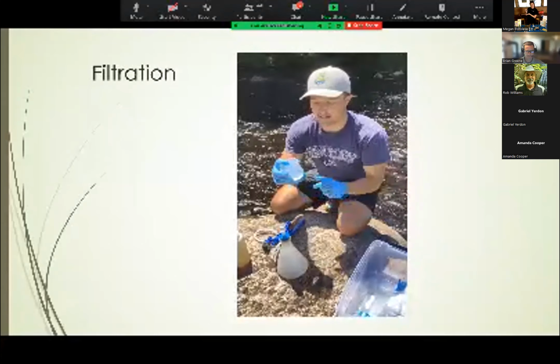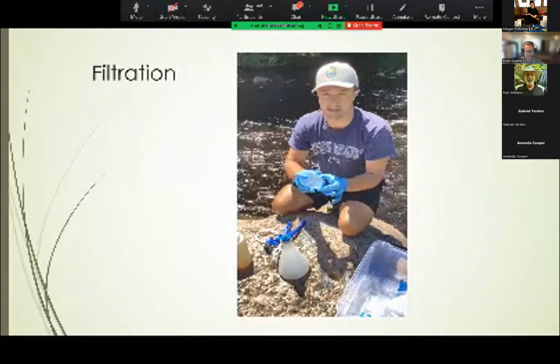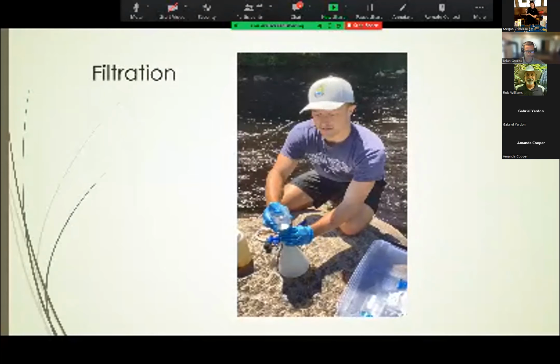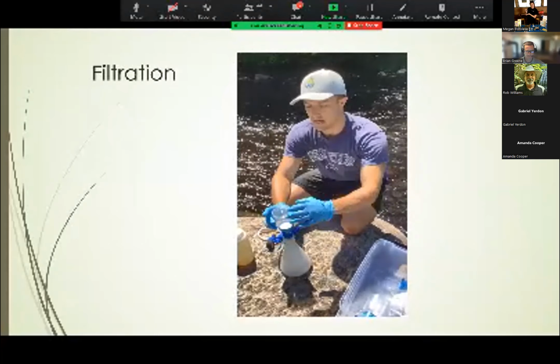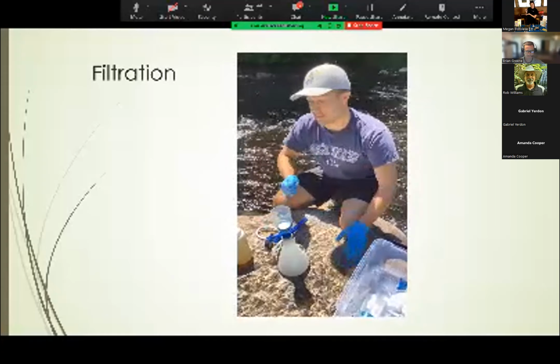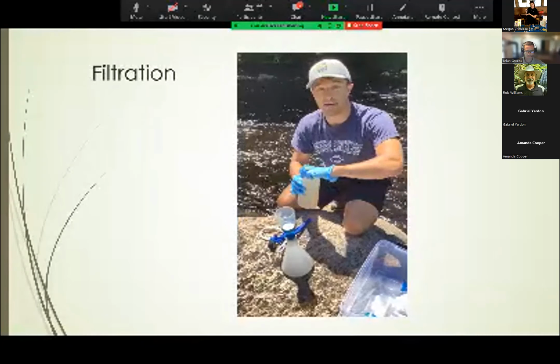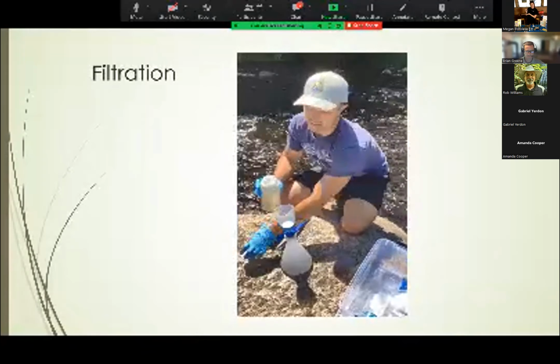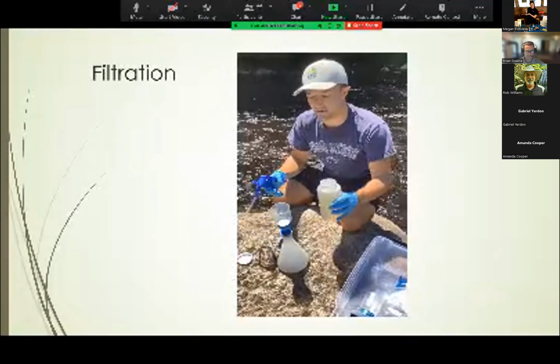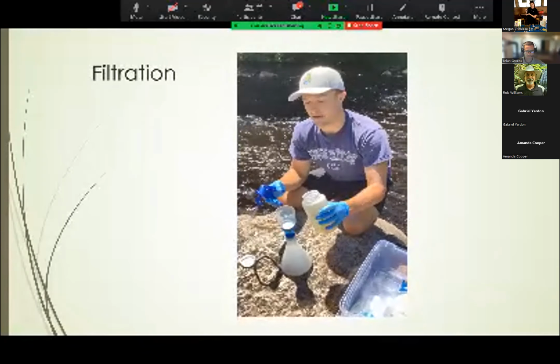Here we have a sterile filter and a housing we received from the lab that processes our eDNA samples. This attaches on top of the flask also. And we're very careful not to introduce any contaminants during any part of this process. So I'm going to go ahead and start the filtration. I'll slowly pour the water sample into the filter housing and draw it through the filter with the vacuum pump.